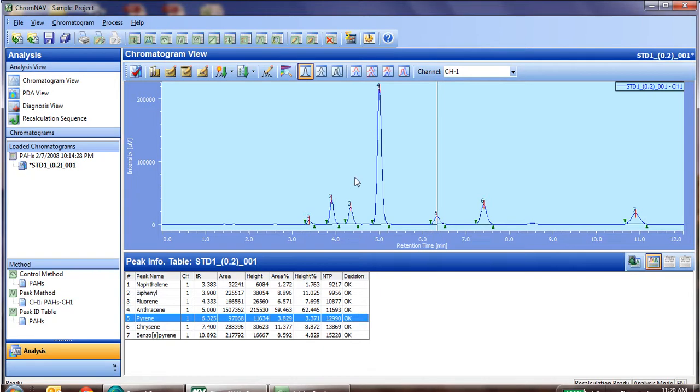Again, you can use any formula you like in the data processing method to generate a system suitability test.